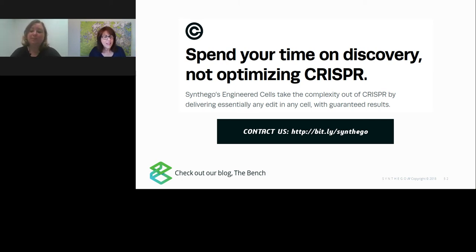Thank you for that. Next one is, what about off-target effects? Do you assess those? That's a great question and one that always comes up. Obviously everyone is concerned about off-target effects with CRISPR. And the thing that we tend to see is that using both well-designed guides, like we are doing with our design tool, and utilizing the synthetic chemically modified single guide RNA format using an RNP to deliver those to cells, we're able to see usually less than 1% off-target effects and usually even no off-target effects.